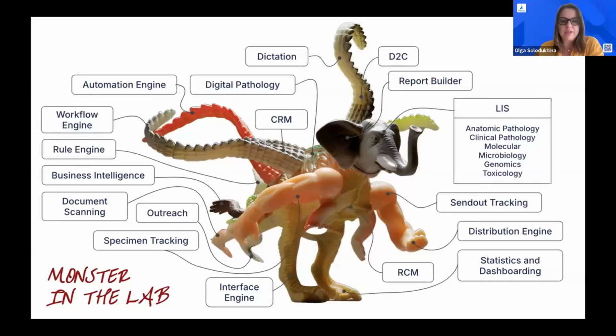Even if you need some custom things sometimes, this is definitely not a set-in-stone solution. We welcome all discussions about the needs of the lab, and if you need customizations, we are open to doing that for you.